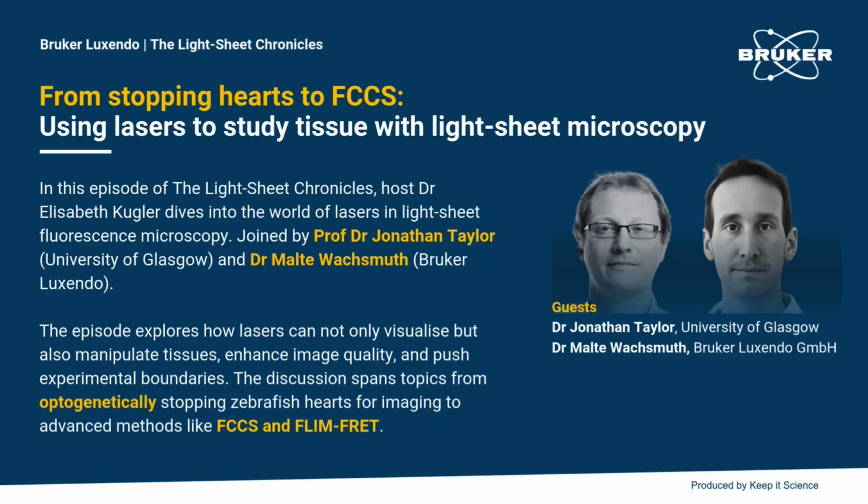So there are all sorts of different variants of light sheet microscopy using different beam types, particularly ones that are referred to as non-diffracting beams, with the thinking being that these particular beam types will propagate for longer distances without having that diffractive expansion that loses the quality of the sheet. So this lets us influence a balance between the imaging resolution, the penetration depth, and also the photo damage.